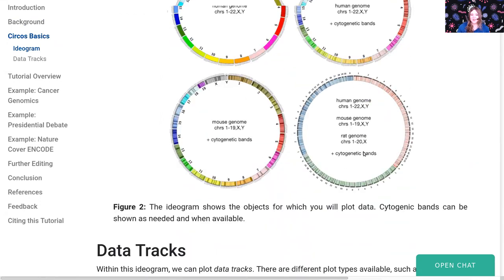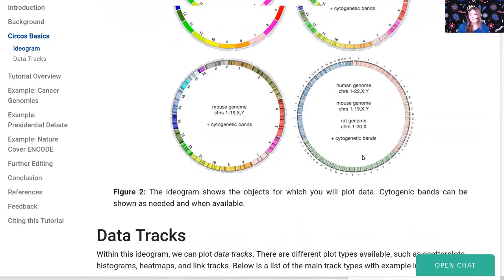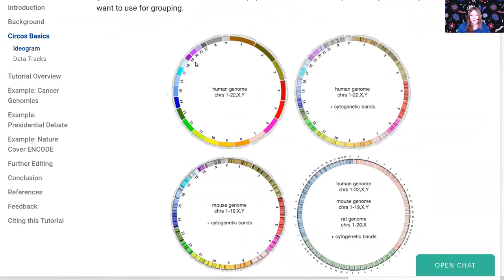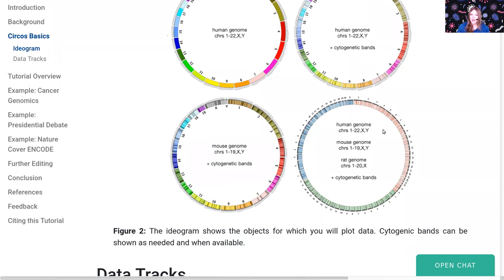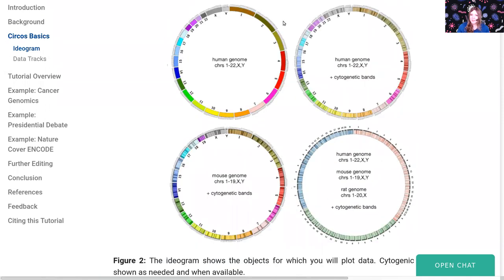However, you can use other data if you want. Here are some examples with and without cytogenetic bands. These just make your plots look nicer and may be relevant for biological reasons. You can plot one genome or you can plot multiple. Here in this example, they're plotting three different genomes all together at once. There are lots of different options that you have with Circos.